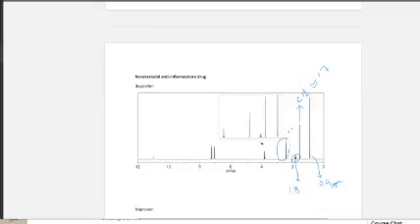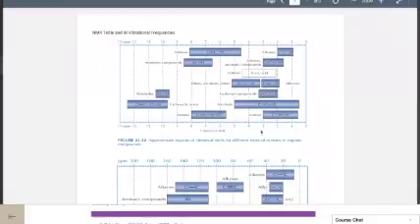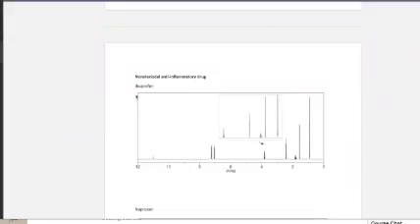This one right here, it is a doublet, and the doublet is going to mean around 2.3, which can represent, based on our structure, which I will show right now here on the drawings. So if we go back and look at the chart, this is around 2.3-ish. It's like a carbonyl compound. And if we take a look at the structure of ibuprofen, ibuprofen has a carbonyl compound. And so then, yeah, this one can be a carbonyl compound.